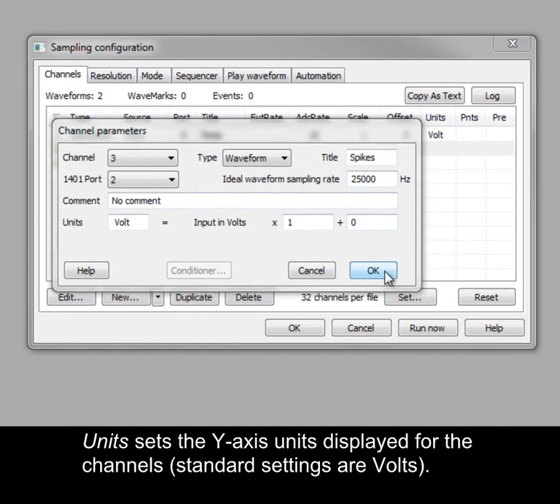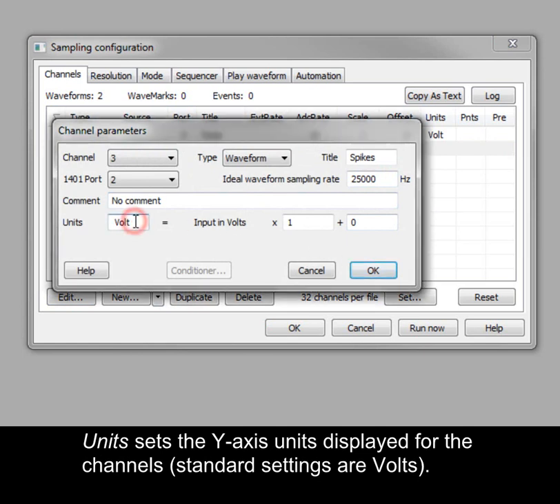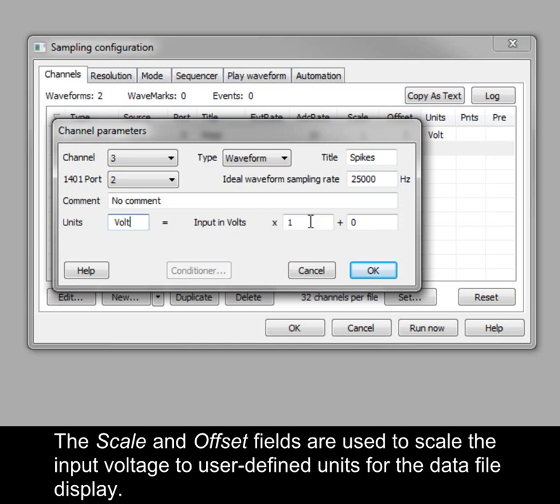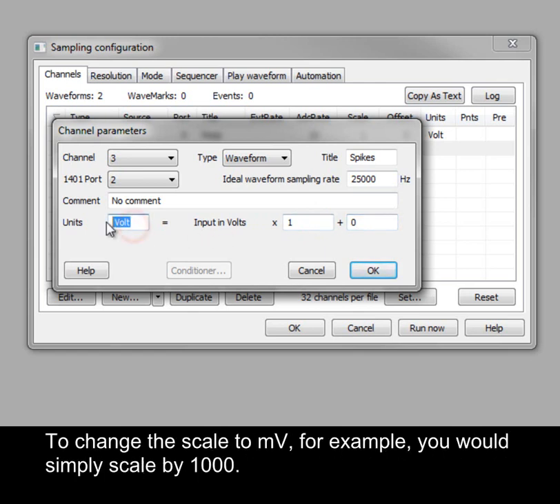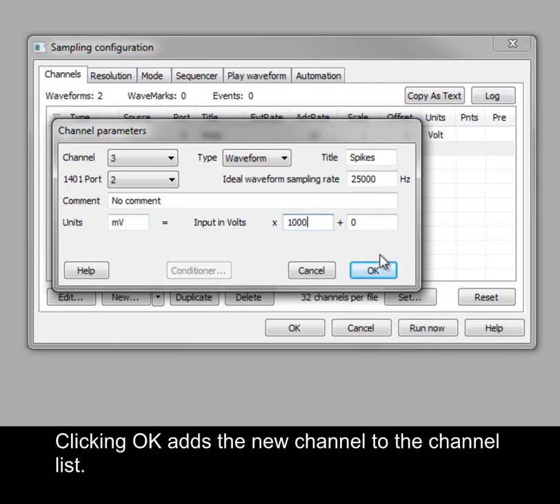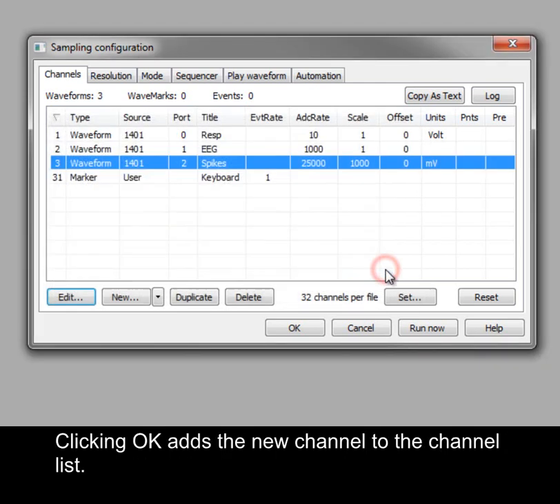Units sets the y-axis units displayed for the channels. Standard settings are volts. The scale and offset fields are used to scale the input voltage to user-defined units for the data file to display. To change the scale to millivolts, for example, you would simply scale by 1000. Clicking OK adds the new channel to the channel list.